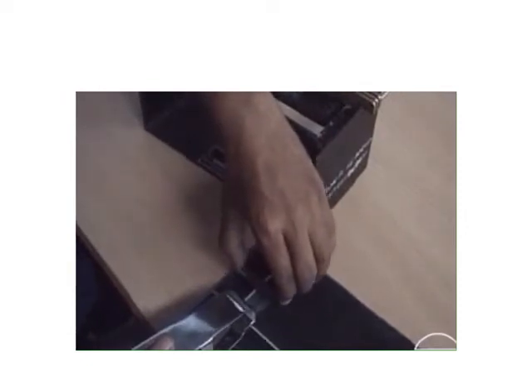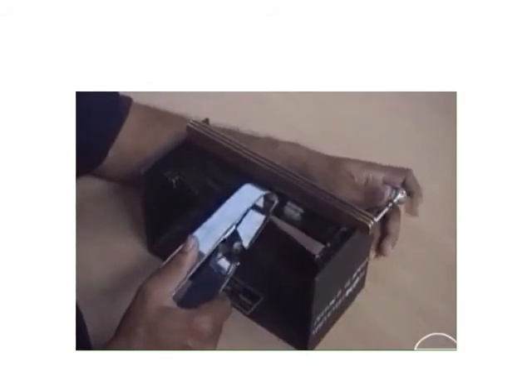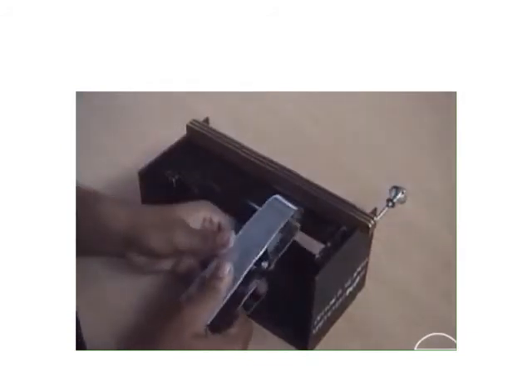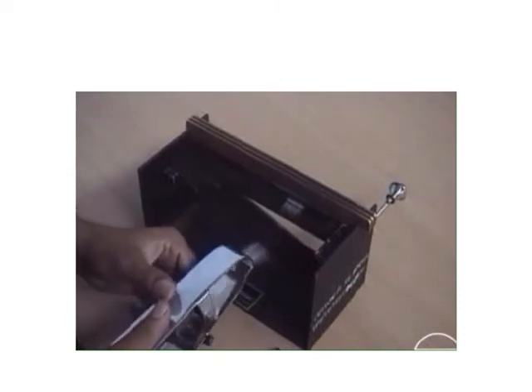and it is pressed inside the velvet pad. Because it is a velvet pad, it will not move. Then the next bottom comb is dropped. The next tallest or longest fiber is pulled, combed by the tweezer, and then arranged nearby. So you are arranging the fibers in descending order.